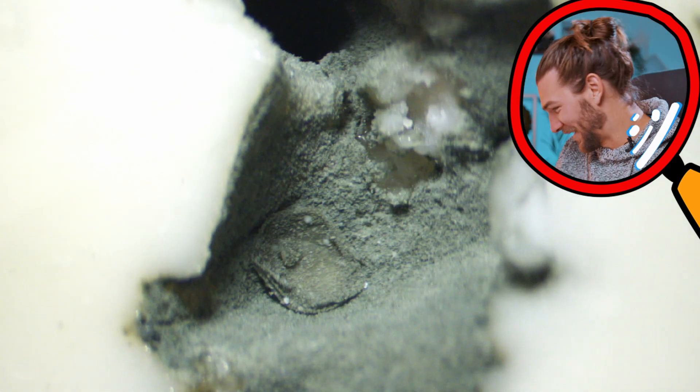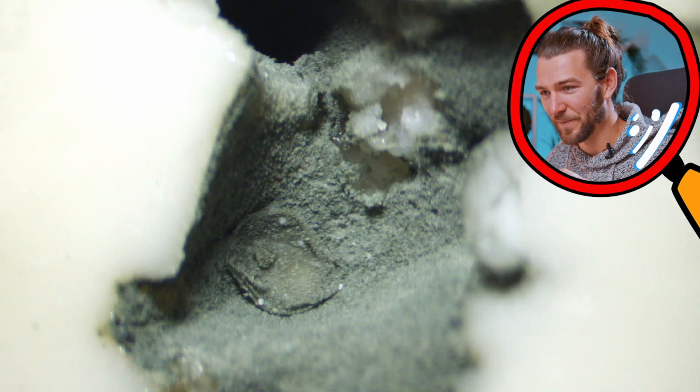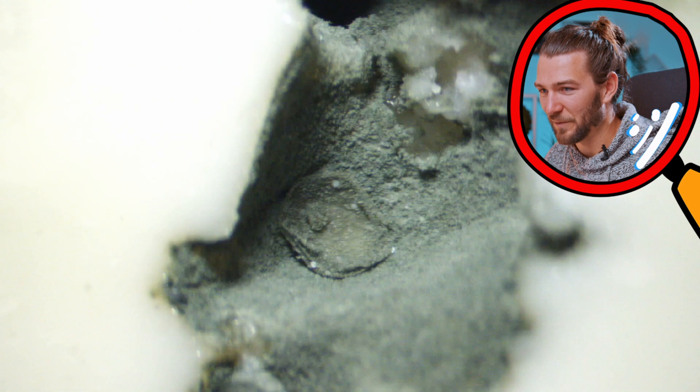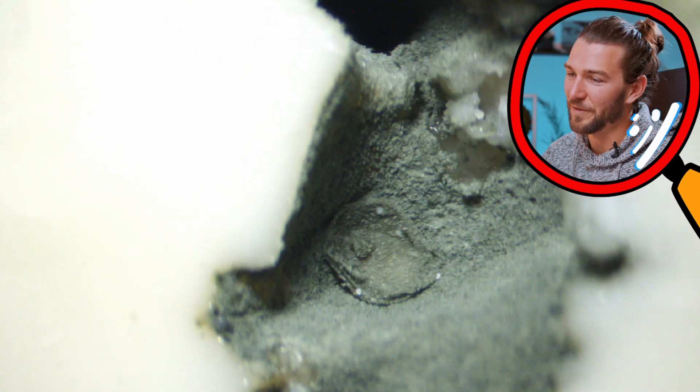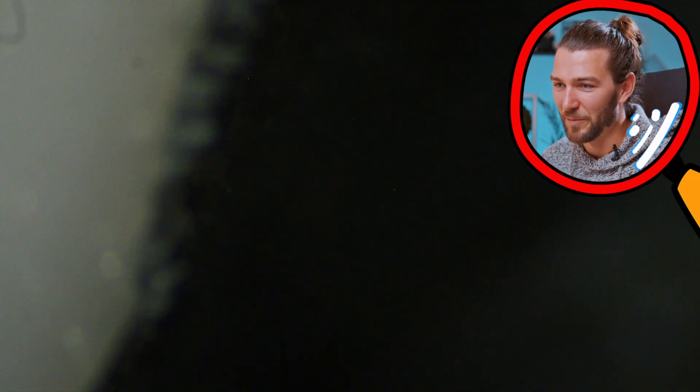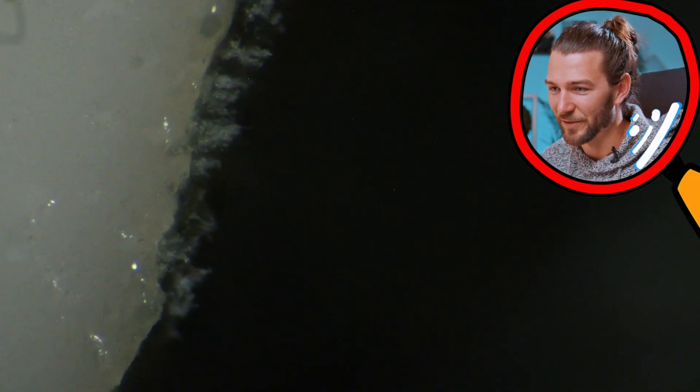If we go here to this other side, you can see it's a very small thin layer on top of the cheese. You can see how the mold is standing out here, sticking out.